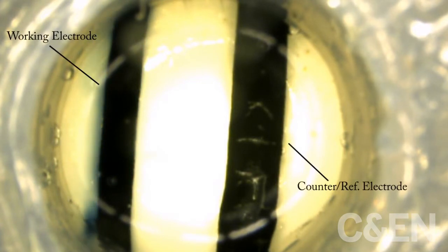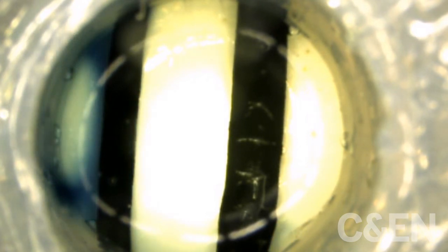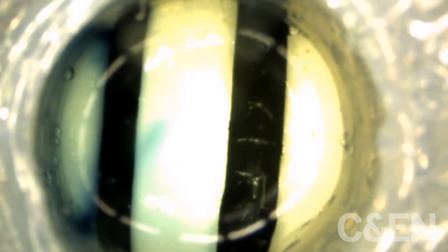One line of black paste served as the working electrode, while the other served as the reference and counter electrode. Using the printed electrodes, the researchers reduced phosphomolybdic acid inside the reactor.